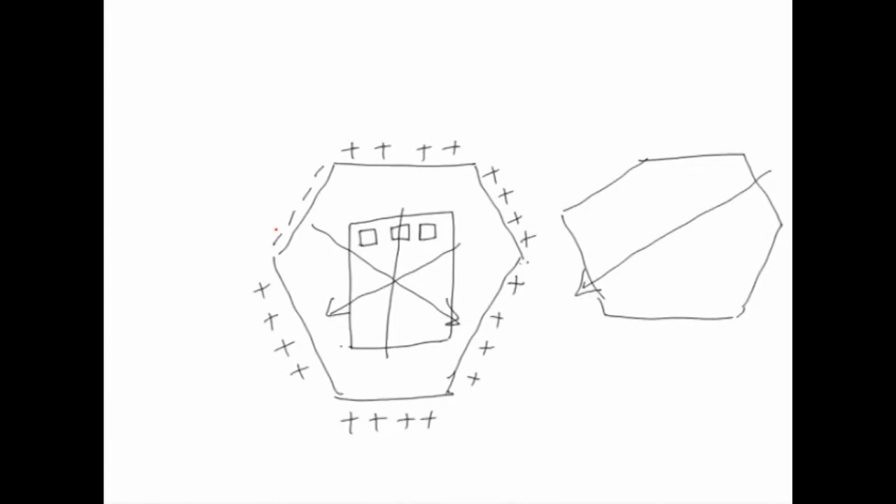In the clamped homogeneous pattern here, you can change it to 120 degrees. There could be other patterns. For these 4 electrodes, in field inversion gel electrophoresis, the pattern will be different.